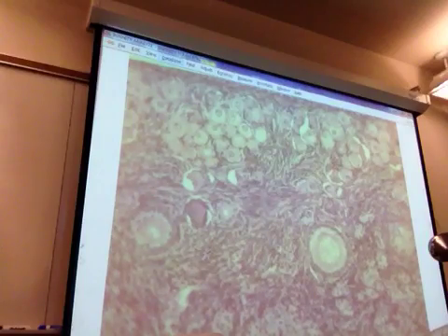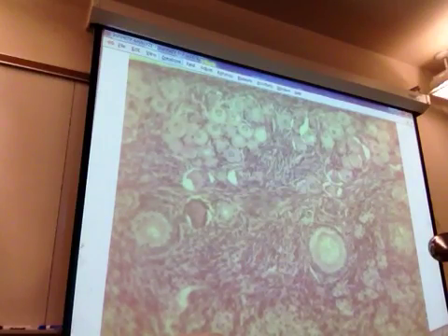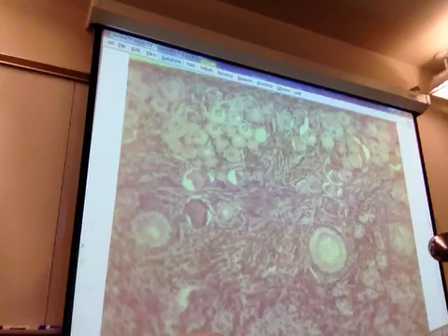So here's one that's not that great because the oocyte's got a weird section, but see how these are the granulosa cells differentiating, and then these ones over here are going to be theca around it. See how they're already starting to turn lighter? But the granulosa cells are those cuboidal ones that are the first ones to pop up.